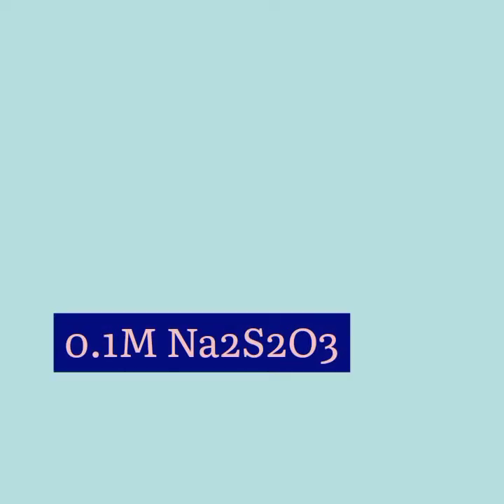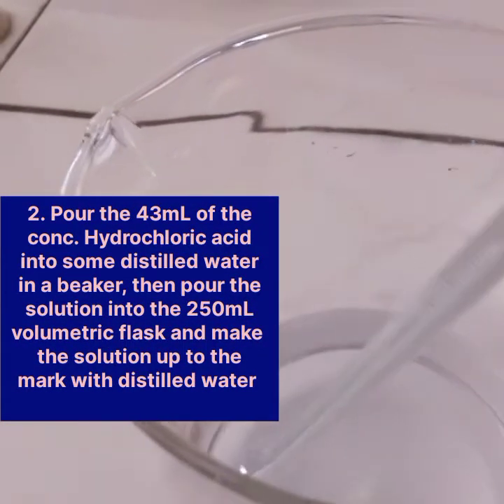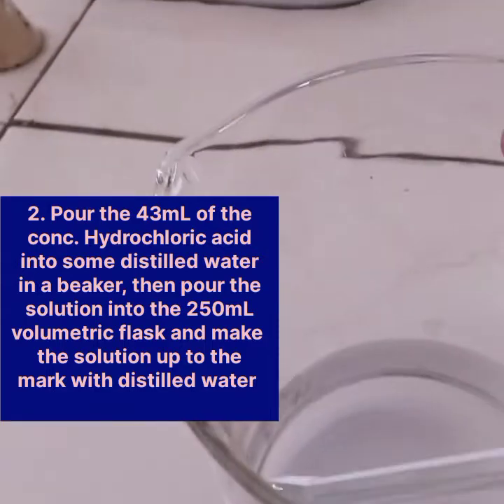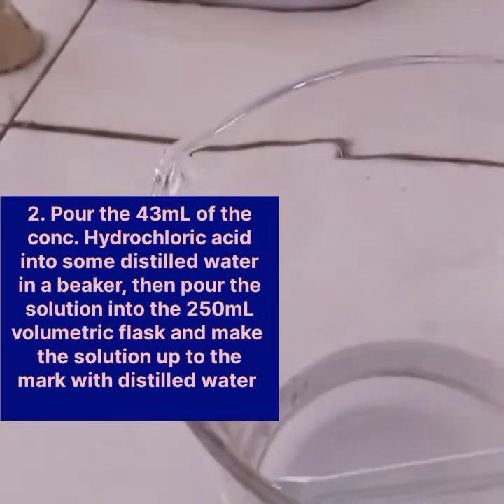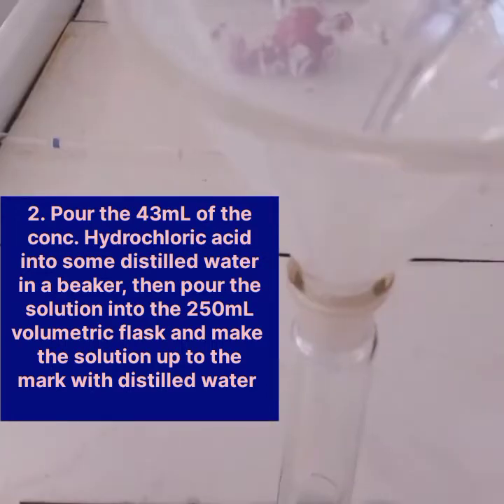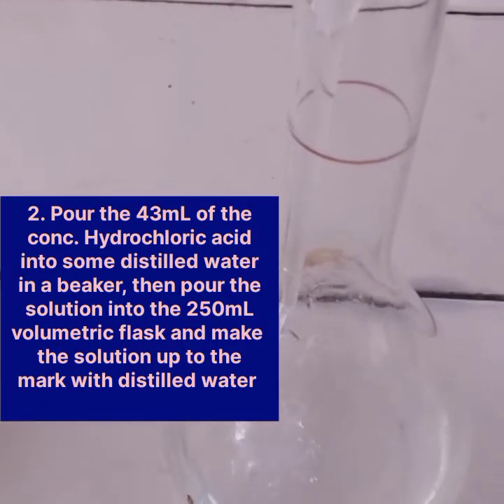The concentration of this solution that we have made is about 0.1 mol per dm³. The next thing is to pour the 43 mls of the concentrated hydrochloric acid into some distilled water in a beaker, then pour the solution into the second 250 ml volumetric flask and make the solution up to the mark.